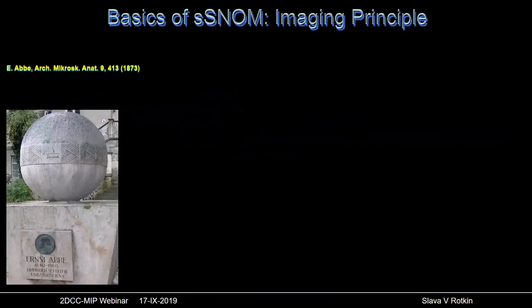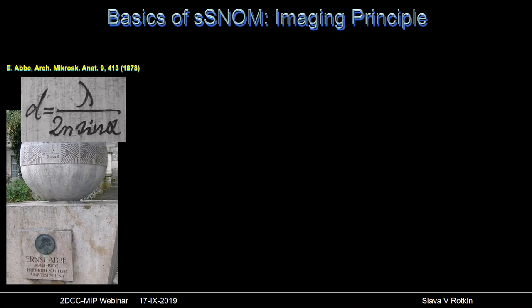And I cannot miss that slide. It shows the monument in University of Jena for Ernst Abbe, and the writing on this monument shows the famous Abbe formula, which goes back to 1873. It's about the resolution of optical microscopy.